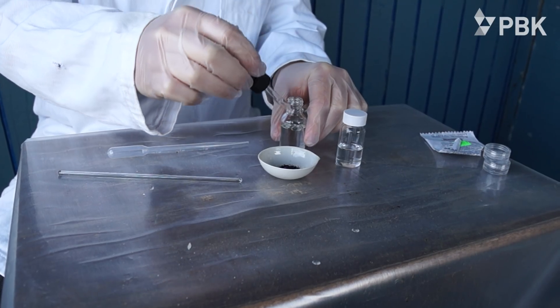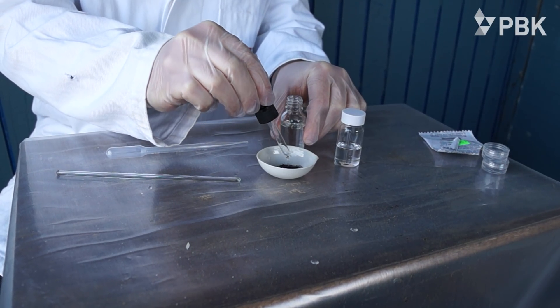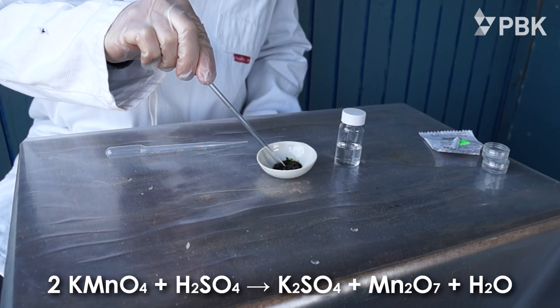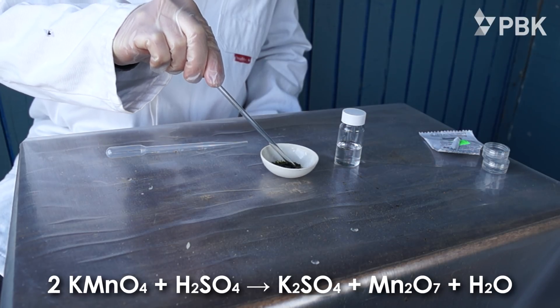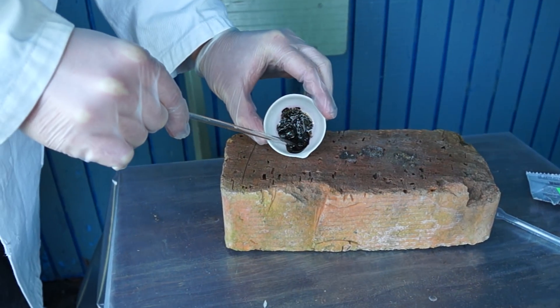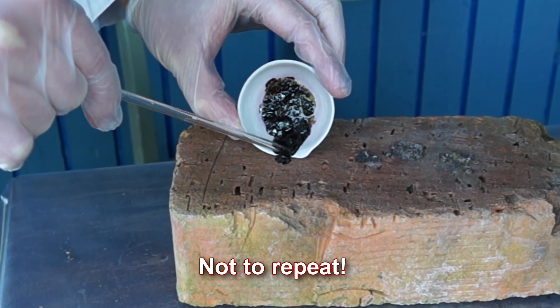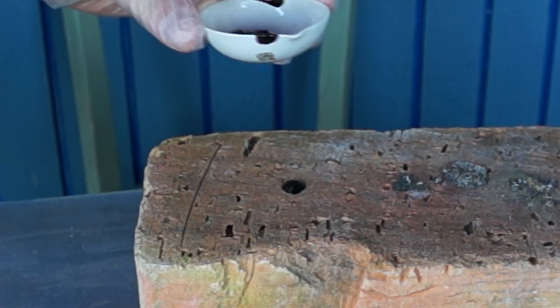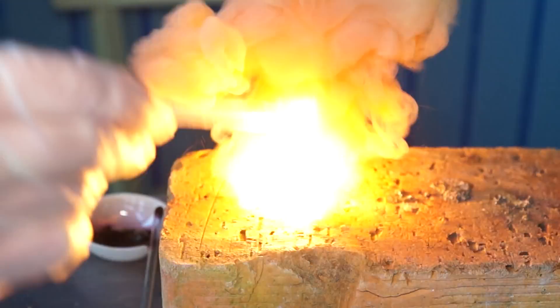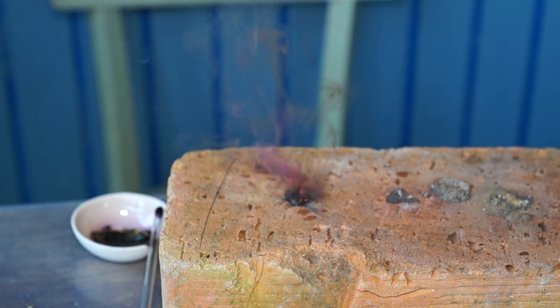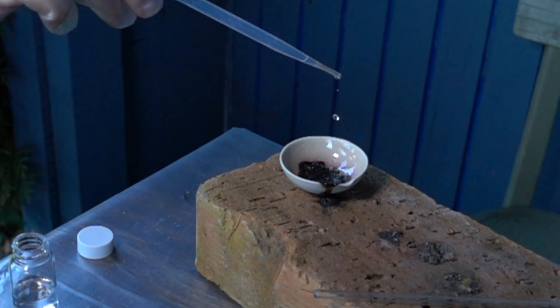If you mix potassium permanganate and concentrated sulfuric acid, you can obtain a hazardous substance, manganese oxide-7. Therefore, I highly recommend you to avoid repeating this experiment. Manganese oxide-7 is a green oily substance which can ignite any combustible material after a simple contact with it.